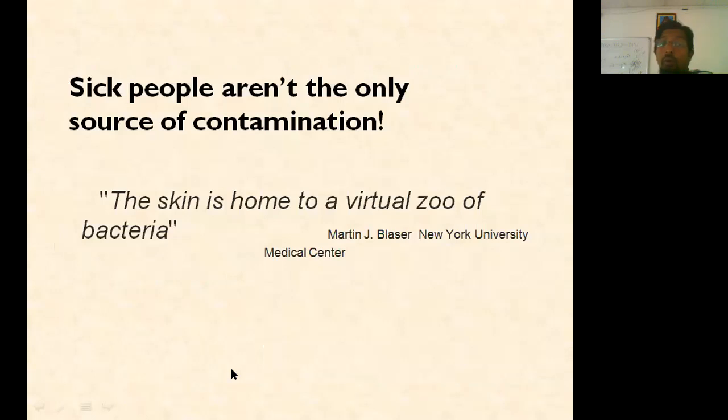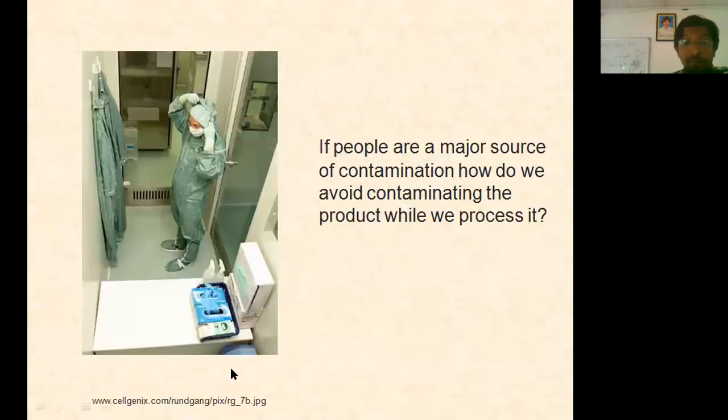Sick people aren't the only source of contamination, and sometimes healthy people can also bring and carry contamination. The skin is home to a virtual zoo of bacteria. Remember, your skin is a zoo for hundreds of types of bacteria, right? So see, a person entering the room in an aseptic area, how should it be monitored? I said there will be an exchange room, yes, with a lot of protective clothing.